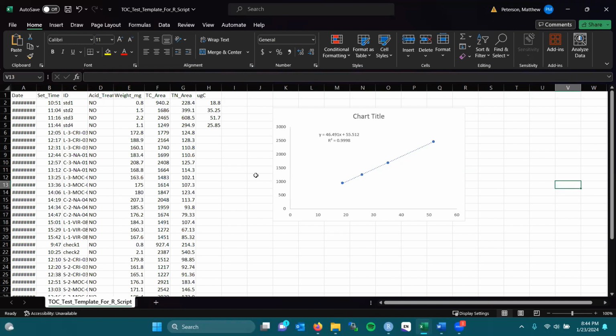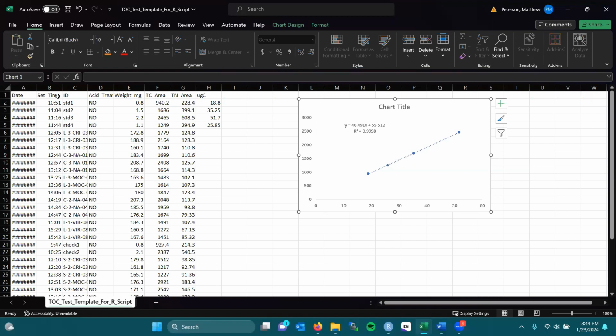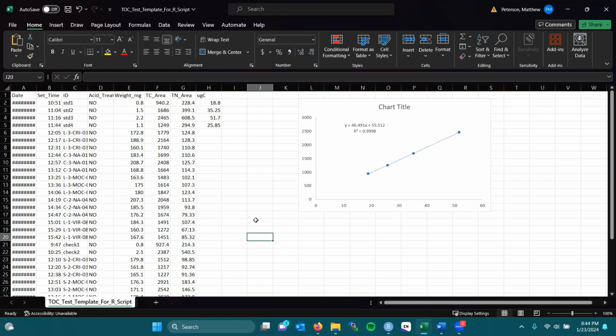Okay, today I'm going to show you how to automate through RStudio to make calculations easier for daily tasks that you may have at hand. For instance, in my lab, we measure a lot of total carbon and total nitrogen. Now, I could continue to calculate this in Excel on a day-to-day basis or project by project basis, but I'm going to show you how you can input what you do in Excel into R to make it more streamlined and save you a lot of time.